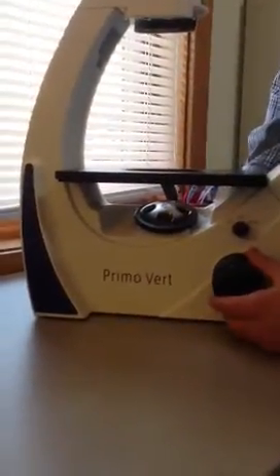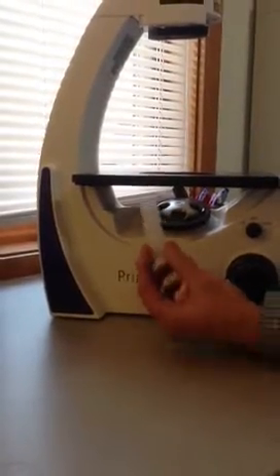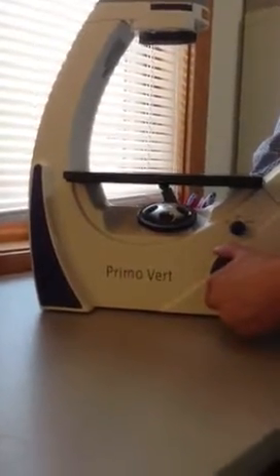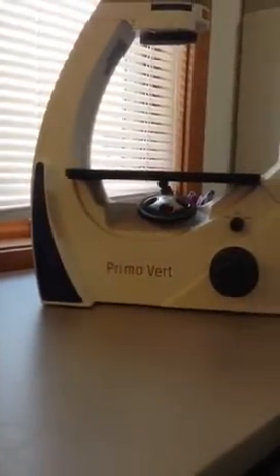First thing you want to start off is removing the styrofoam from under the nose piece — it's in there for shipping. Using the focus, move the nose piece up and pull the styrofoam piece out. Keep this because when you ship it back, you're going to need to put it back in there and crank the nose piece down on it. Set it to the side and keep it for later.